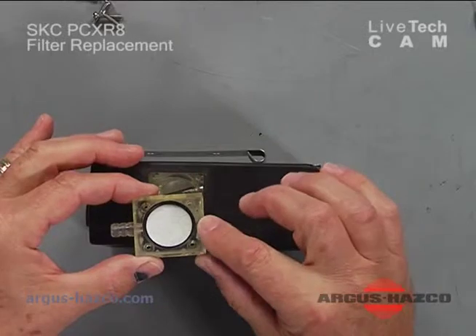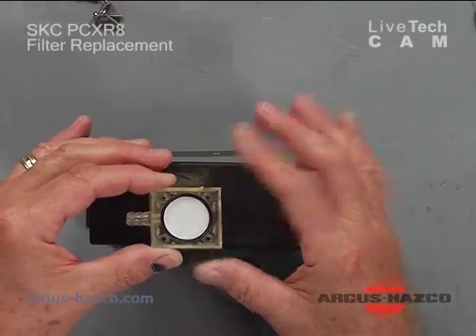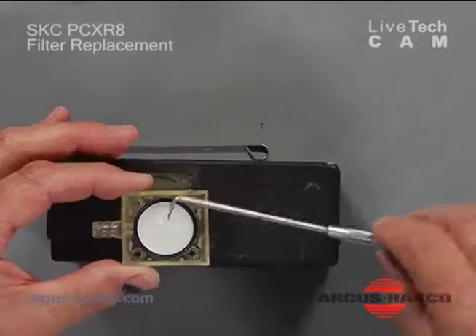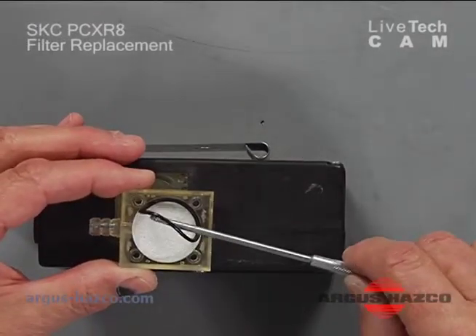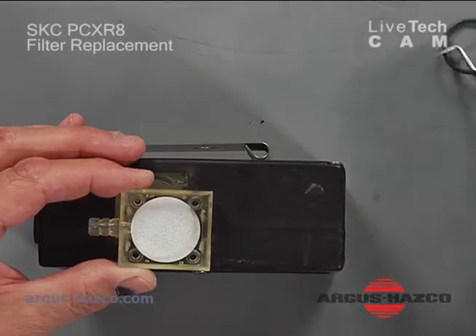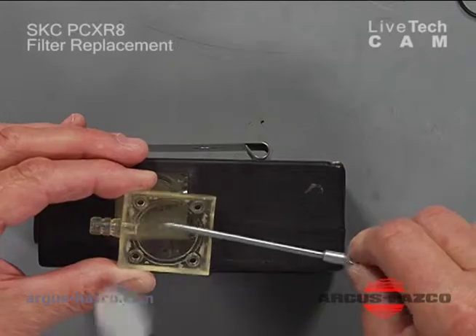The filter and the o-ring will usually be inside the top half of the housing. You will take your sharp implement — a pick or a small screwdriver — lift out the old o-ring, and then lift out the old filter.